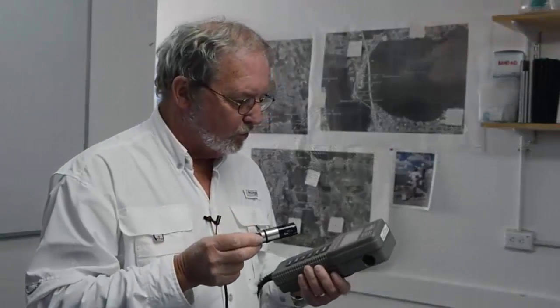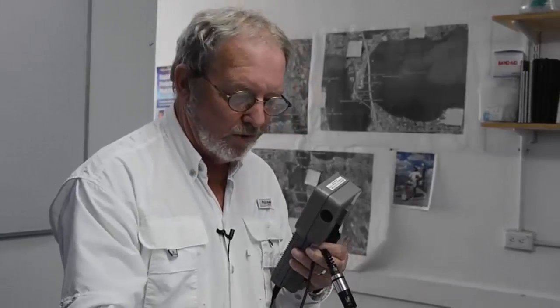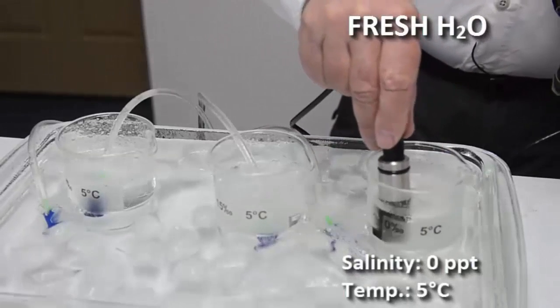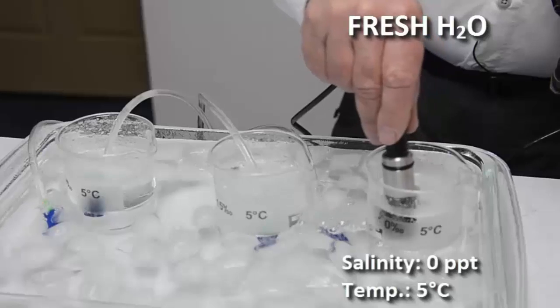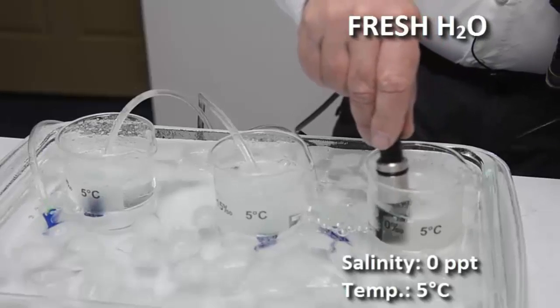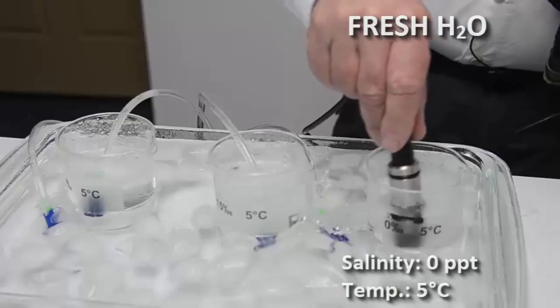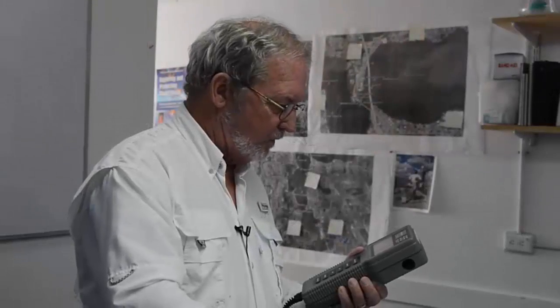So what we're going to do is start now with the fresh water and we're going to begin with cold fresh water, zero parts per thousand, five degrees centigrade. This takes a little while as you can see I slightly stirred the probe in the fresh water. Looks like we're slowing down here at 12.4 parts per million.